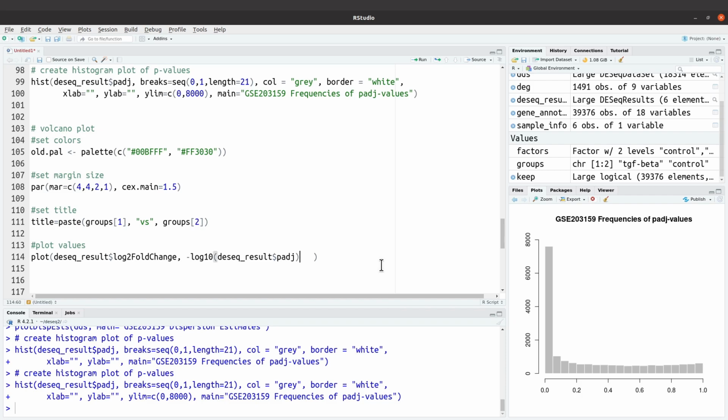Now we need to add a title, which is what I set here. There's a title, right? So I can do it here: main equals title. Alternatively, you can just put everything here as well, but in order not to get confused, I defined it previously. If you have your own title, you can just put it in double quotes. But I have defined it previously, so I'll just use that.